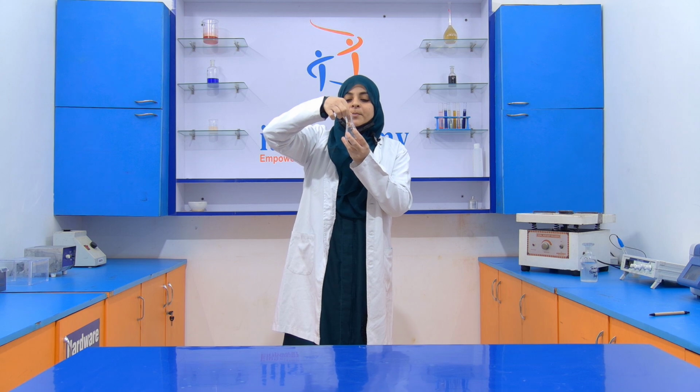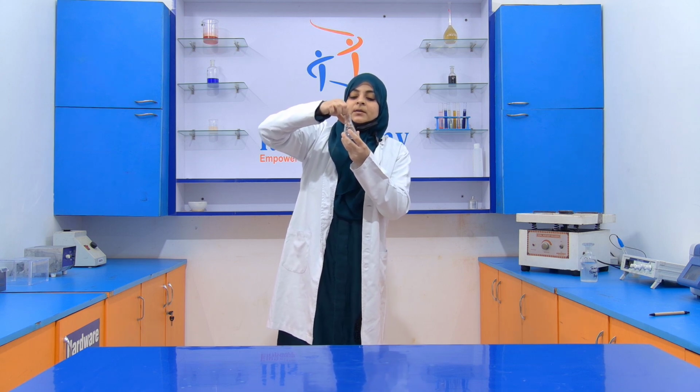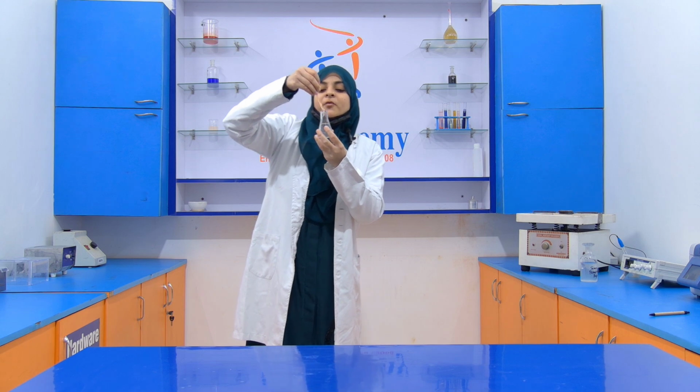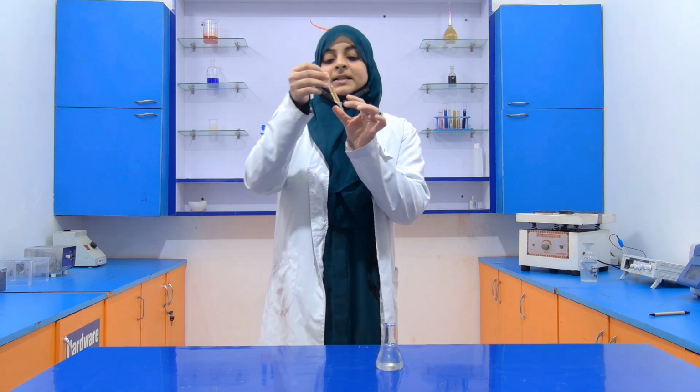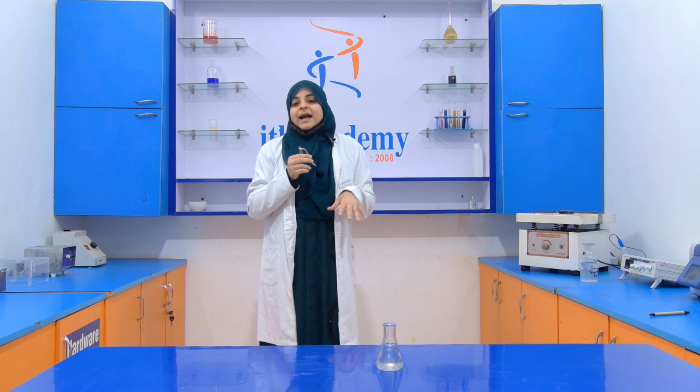Now I am removing the dialysis bag from the buffer solution, and this protein is known as dialyzed protein, and it is used in further experiments like ion exchange chromatography.